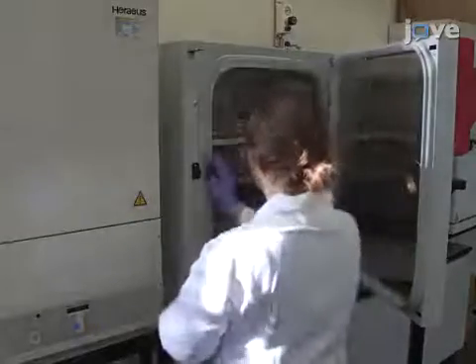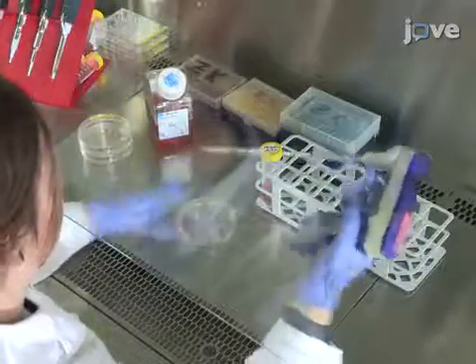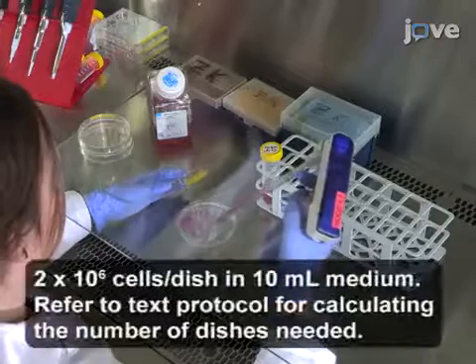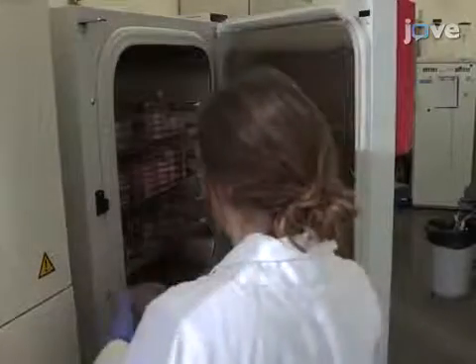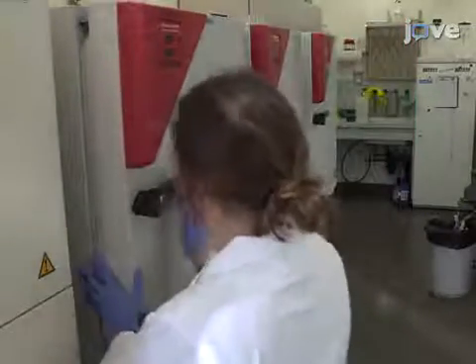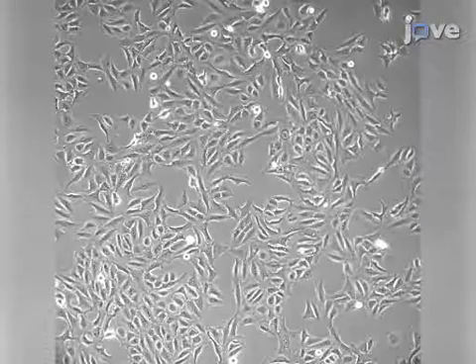U2-OS cells are used for this experiment and should be seeded in 100 mm dishes in the evening around 7 p.m., so that subsequent steps can be carried out during working hours. Let cells attach by incubating the dishes at 37 degrees Celsius in a humidified atmosphere with 5% CO2 for 24 hours. On the following day, examine the cells to confirm that they are at 50% confluency.